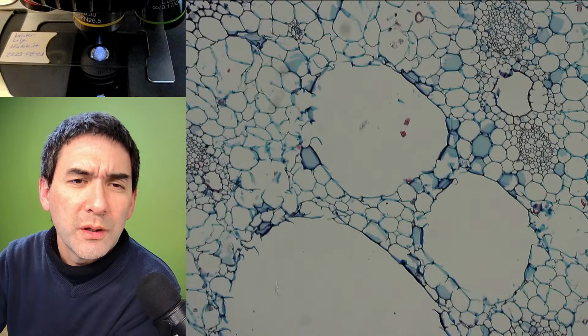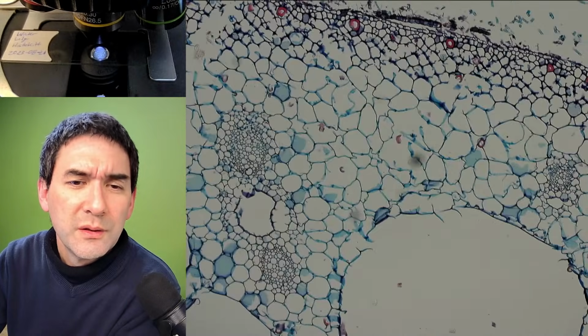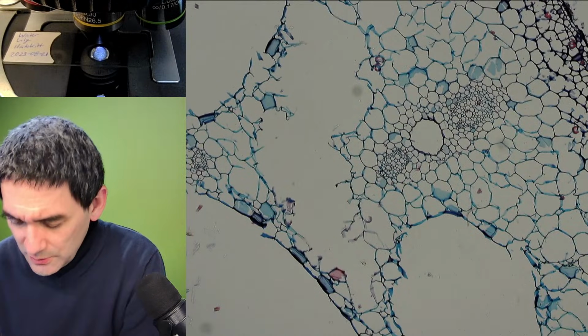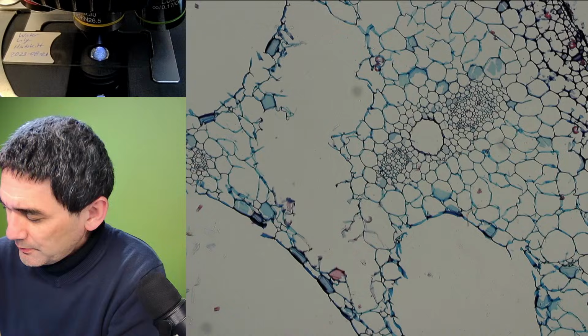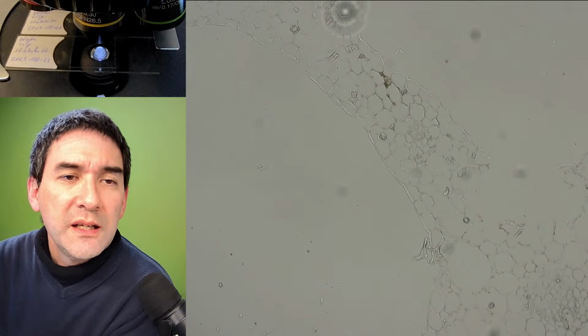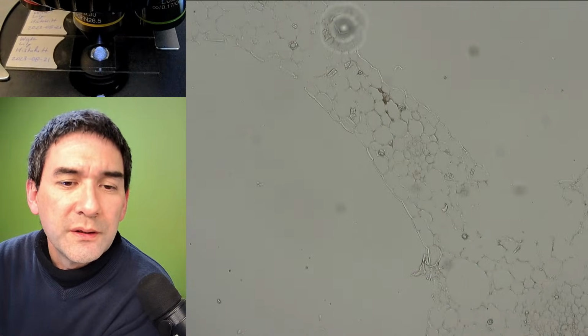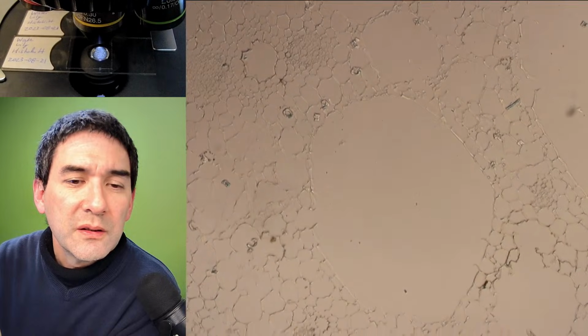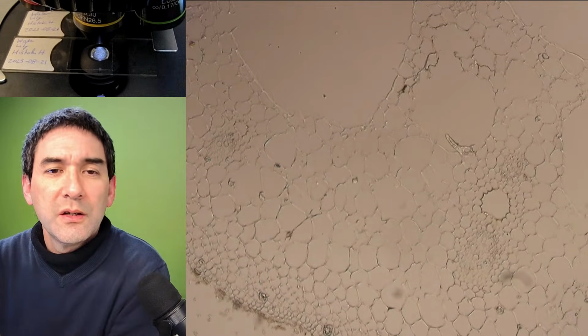Oh, come on, where are they? There was another one. Or maybe it was on the other slide, I don't know. Let me quickly check. This one is cut much thinner. Yeah, he cut them at different, how do you say, thicknesses. Maybe they're easy to see. Yeah, so I got 3 slides of the water lily. Oh gee. Here's another one.